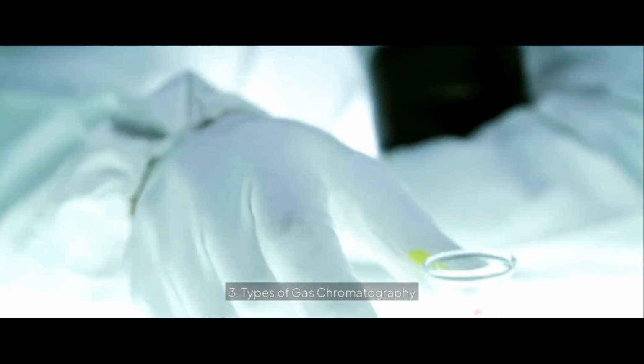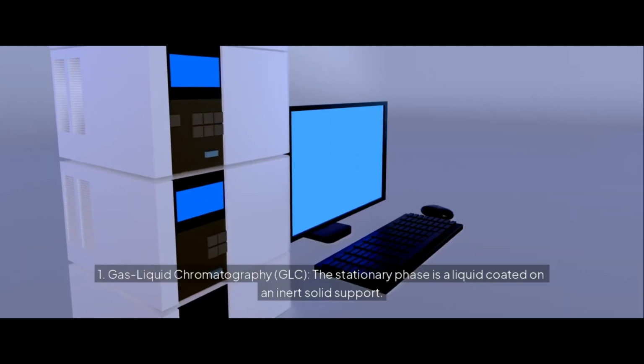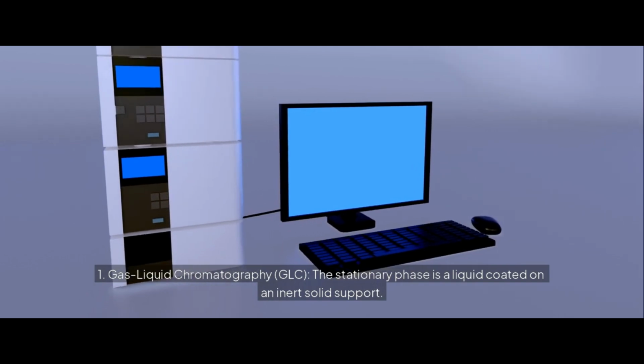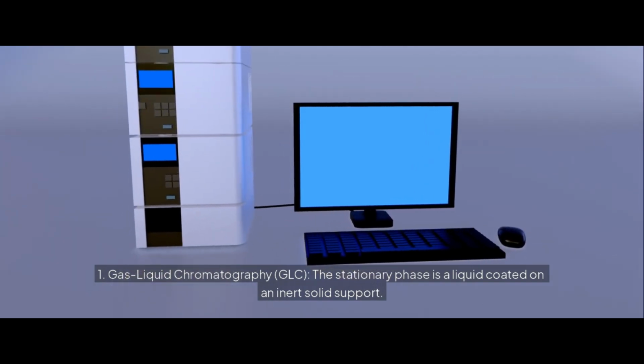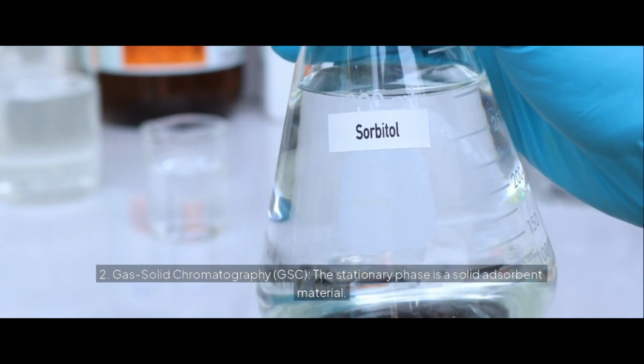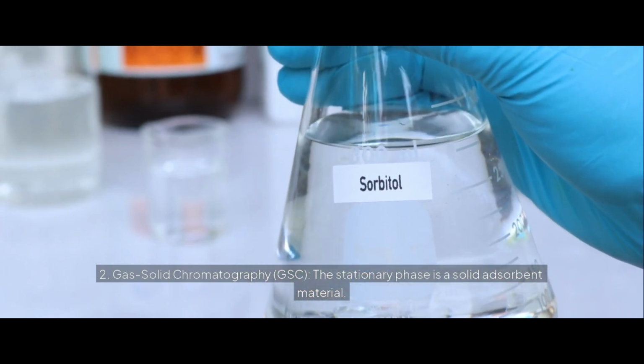3. Types of gas chromatography. 1. Gas-liquid chromatography, GLC, the stationary phase is a liquid coated on an inert solid support. 2. Gas-solid chromatography, GSC, the stationary phase is a solid adsorbent material.